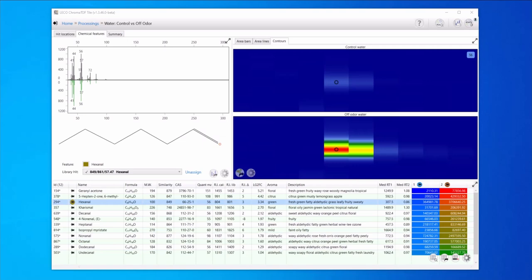After processing, analyte information is compiled in the chemical feature table. Here we have a focused list of some of the analytes that were higher in the off odor sample.